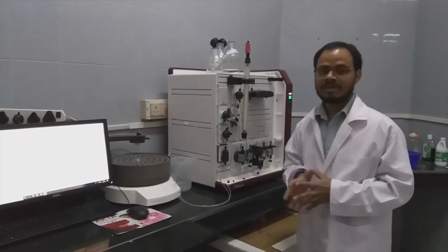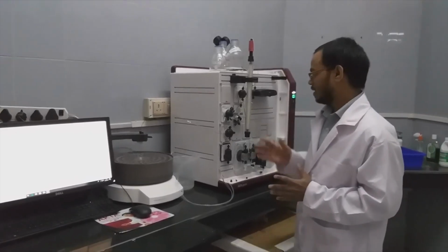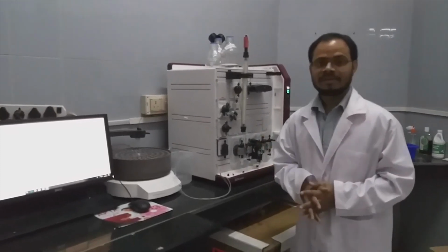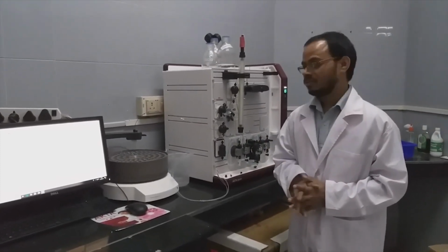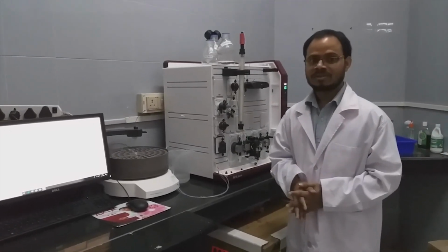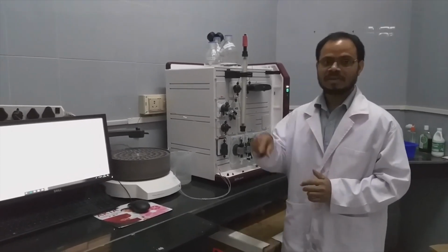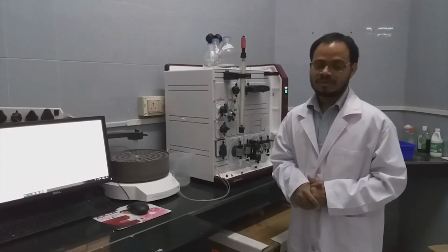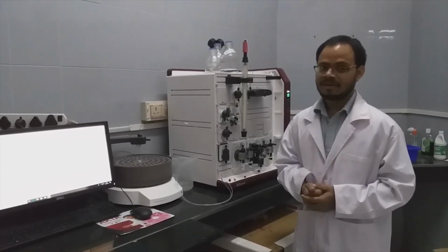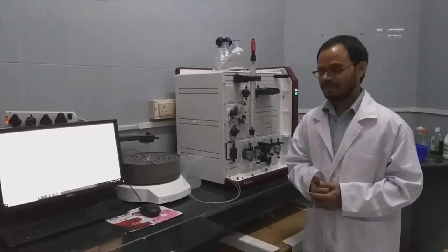So this is the gel filtration column attached to a protein purification system. Here we will inject blue dextran and BSA and show their pattern. Blue dextran gives the void volume of the column, and BSA gives the actual elution pattern. If you run a few more proteins with known molecular weight, we will get a calibration curve. With that we can calculate the molecular weight of unknown proteins.